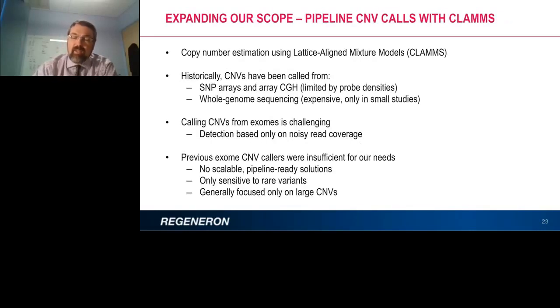Now, a little bit of a sideline. I had mentioned earlier this idea that the QC data can have some fundamental value beyond just understanding the QC. And so one of the stories I really wanted to hit was talking about expanding the scope of what we do at the Genetics Center here. Primarily what people historically have looked at are SNPs and indels. These are single nucleotide variants, small indel variants.